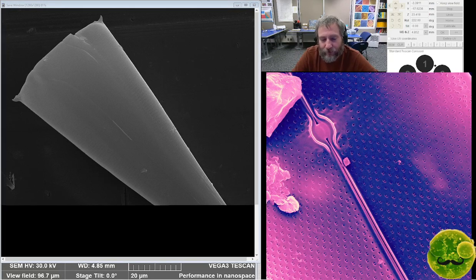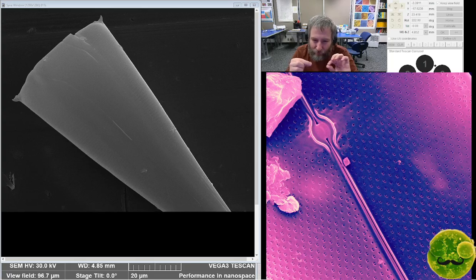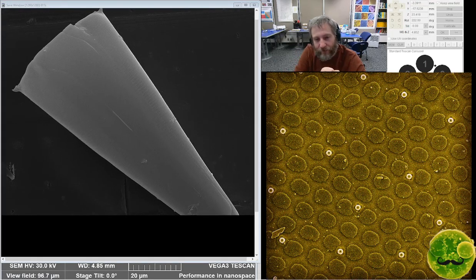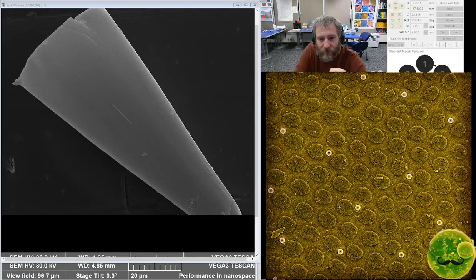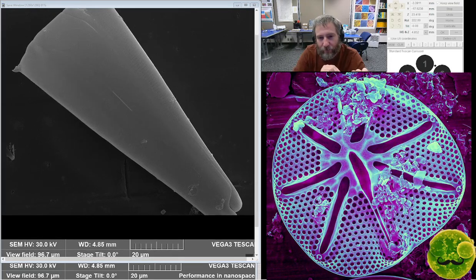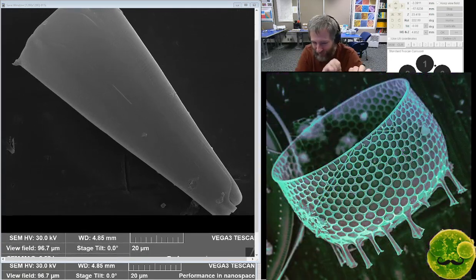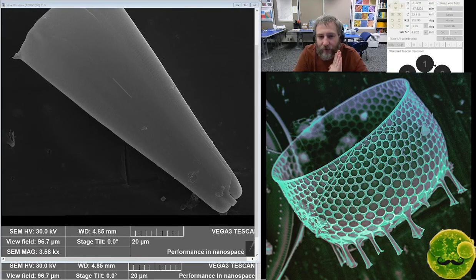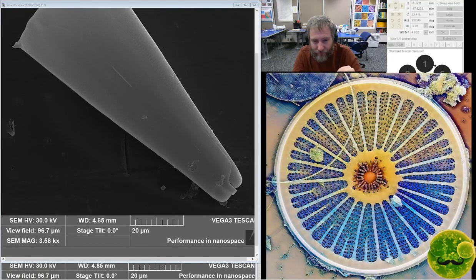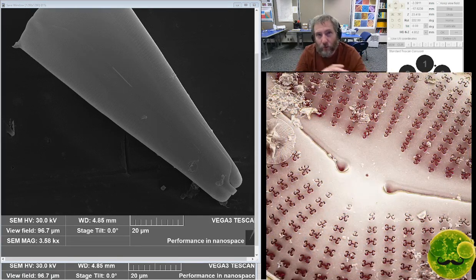An atomic force microscope has a really thin piece of metal, I think, that moves around objects, and as it gets closer to them, it starts to vibrate with more frequency. It uses the vibrations to feel or sense an object without ever touching it. It uses atomic forces to detect the position of things. What it creates is a 3D image, a sculpted image of these microstructures, by detecting the force of those atoms. So it's a totally different tool, and it basically detects the vibrations of atoms and their atomic forces, and then turns that into a 3D model.